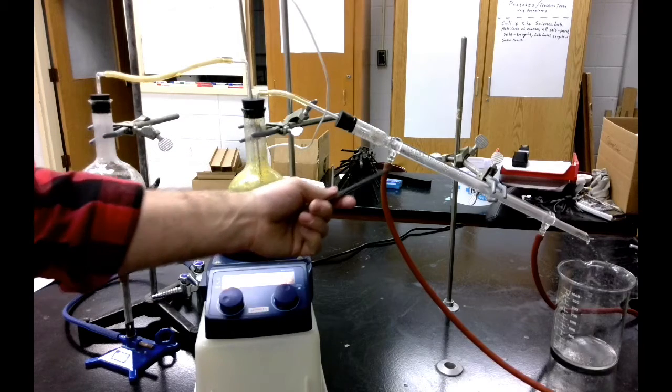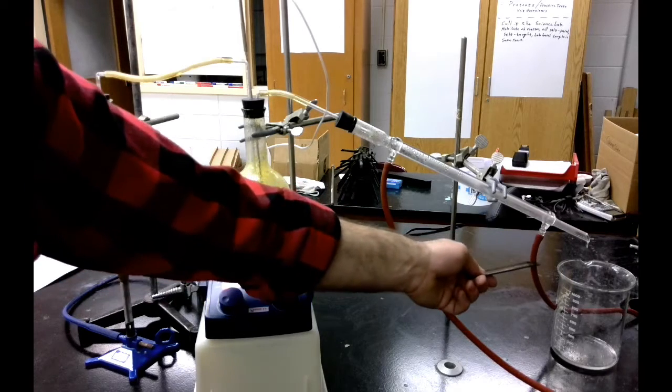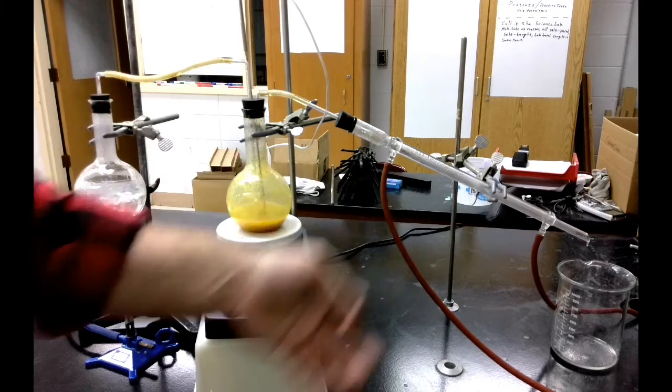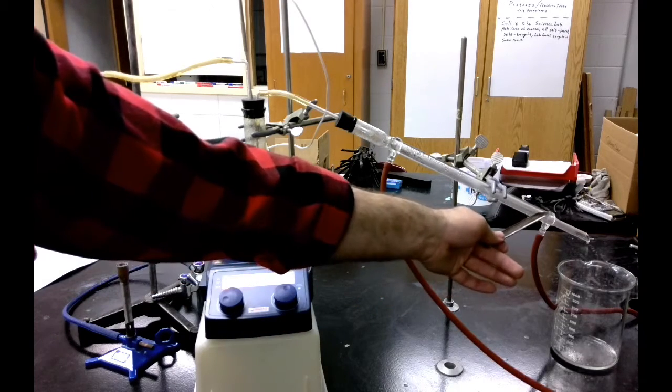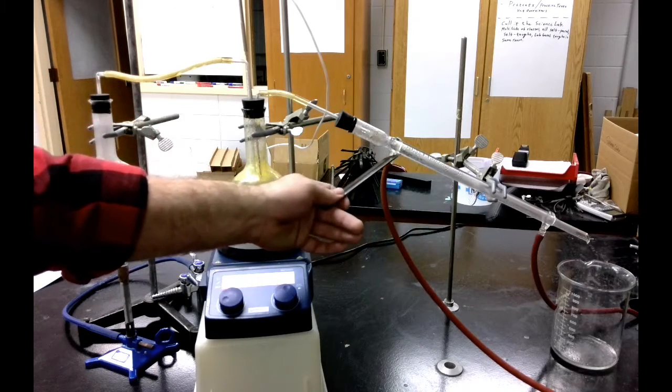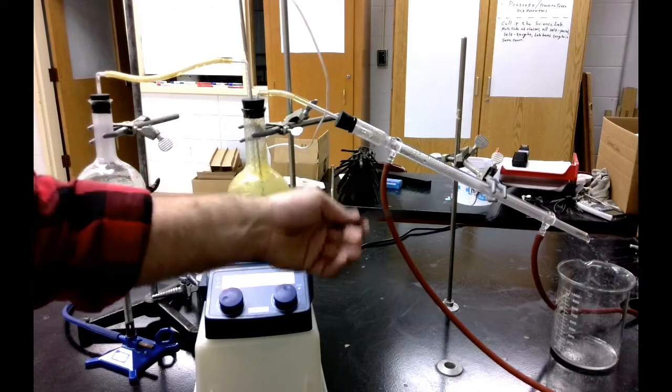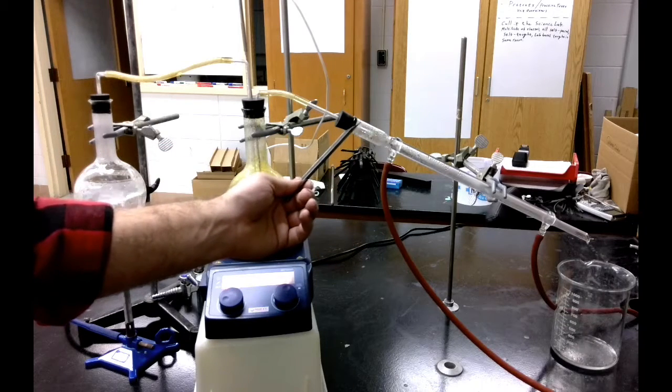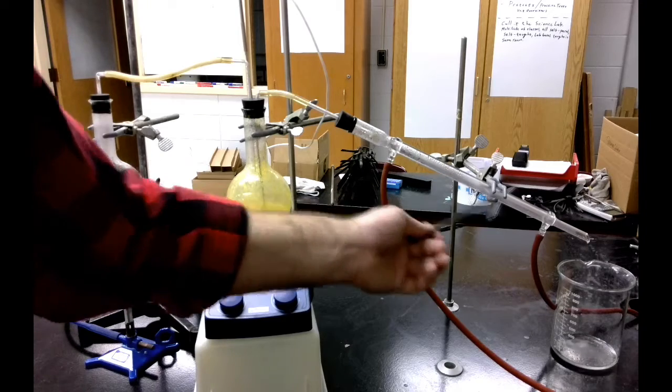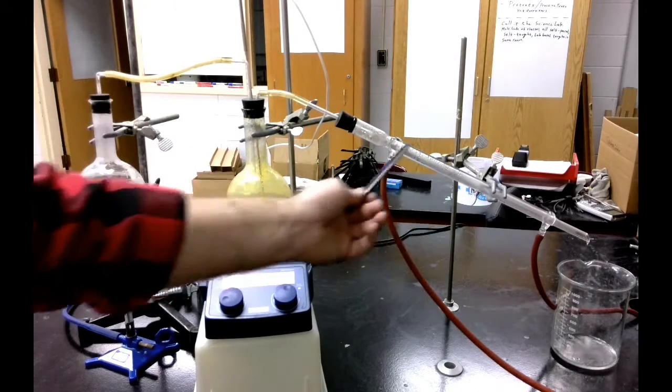This is called a condenser. What this does is it has fresh water coming in from the tap, it goes through a double-walled glass tube, so water is able to flow from here up through here, and then on the inside it's hollow, the water can't get all the way in, and I've got the gas traveling through this tube, and it's being cooled down by this water that continuously flows through here.